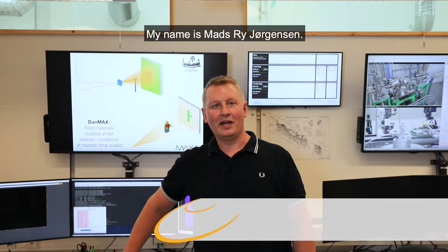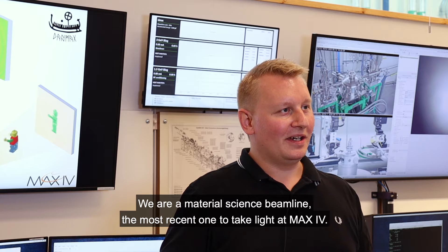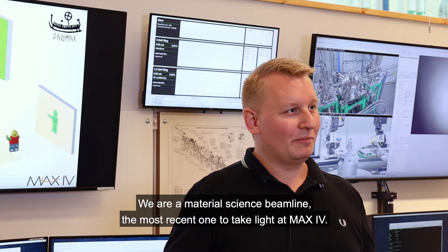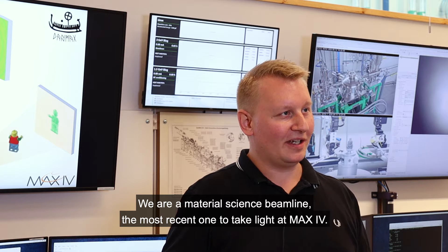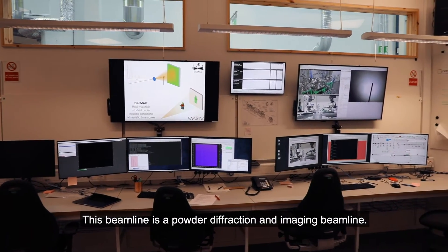Welcome to DanMAX. My name is Mads Ry Jørgensen. I am one of the two beamline scientists here at DanMAX. We are a material science beamline, the most recent one to take light at MAX IV. This beamline is a powder diffraction and imaging beamline.